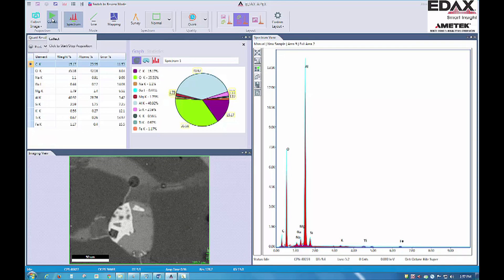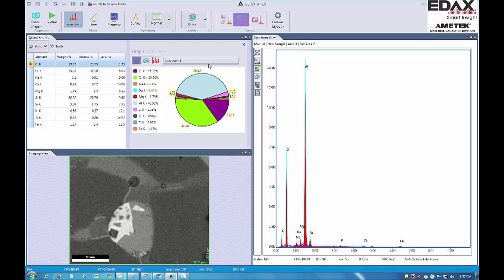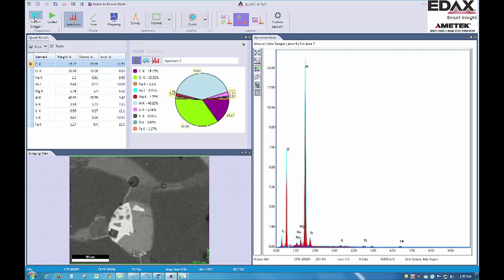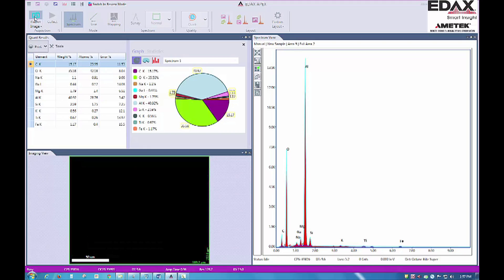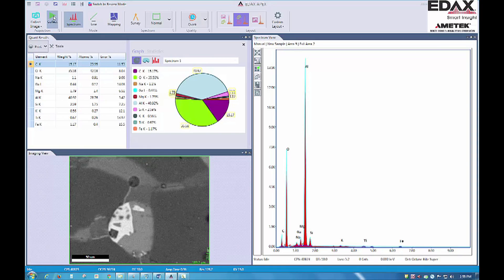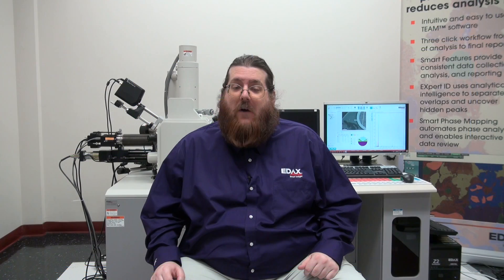The streamlined user interface guides any level of user through a quick and logical workflow, with live-time quantitative results and the ability to review and report data while collecting. Software screen layouts and color themes allow users to customize the workflow to maximize their own productivity for their specific task.